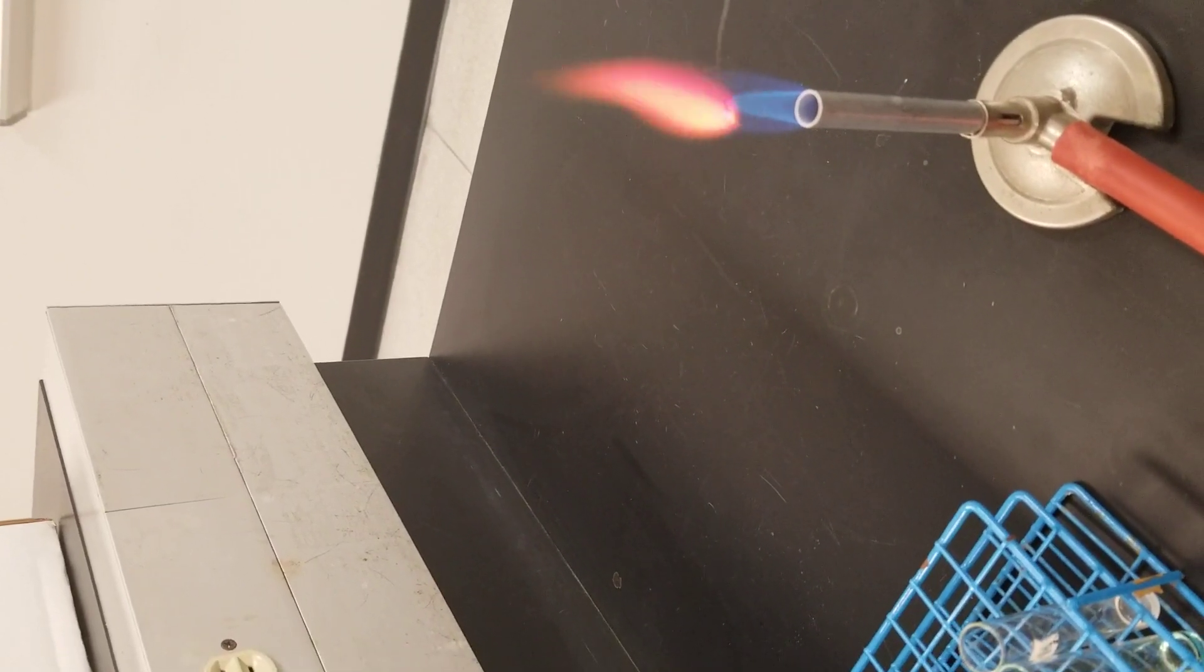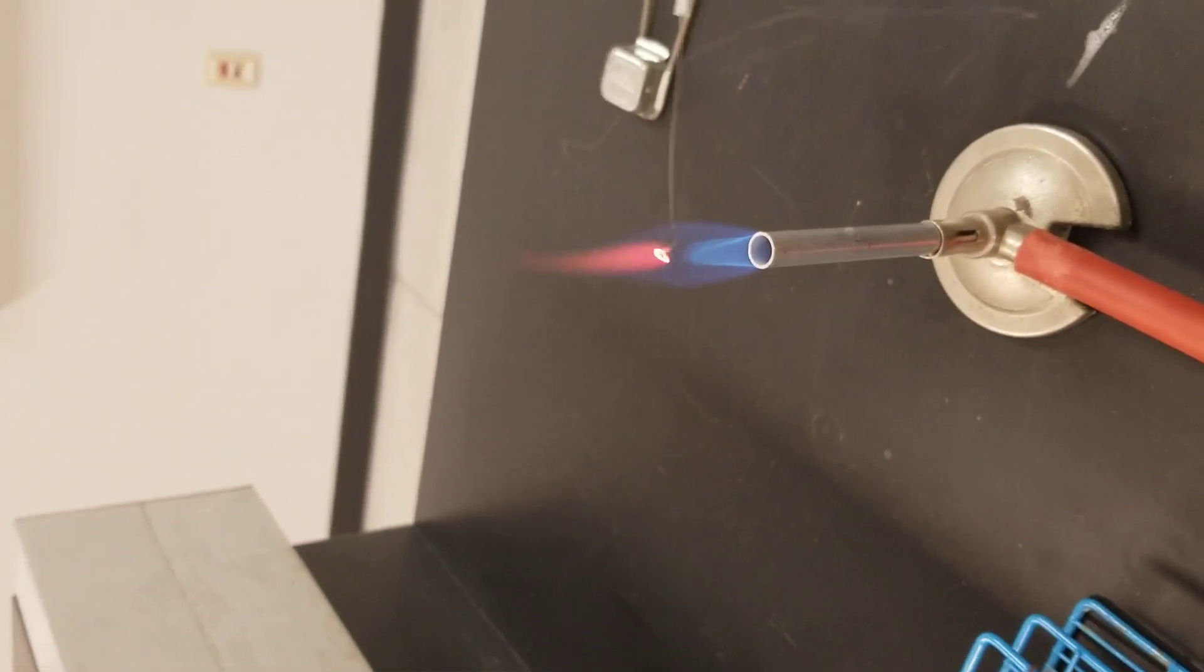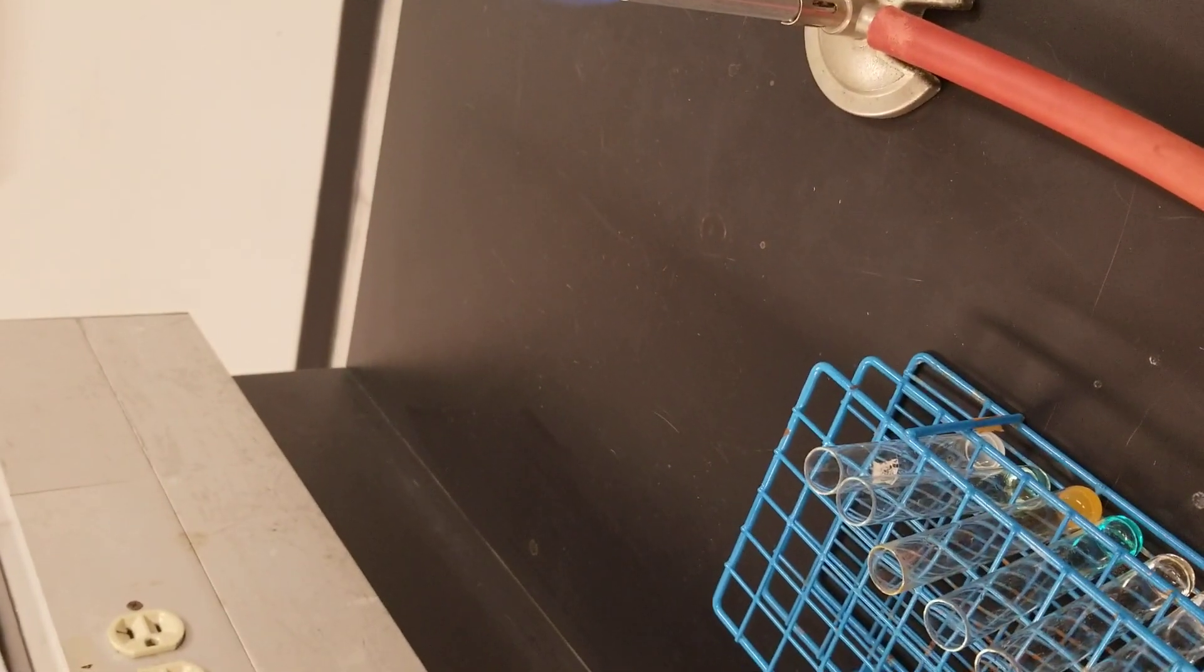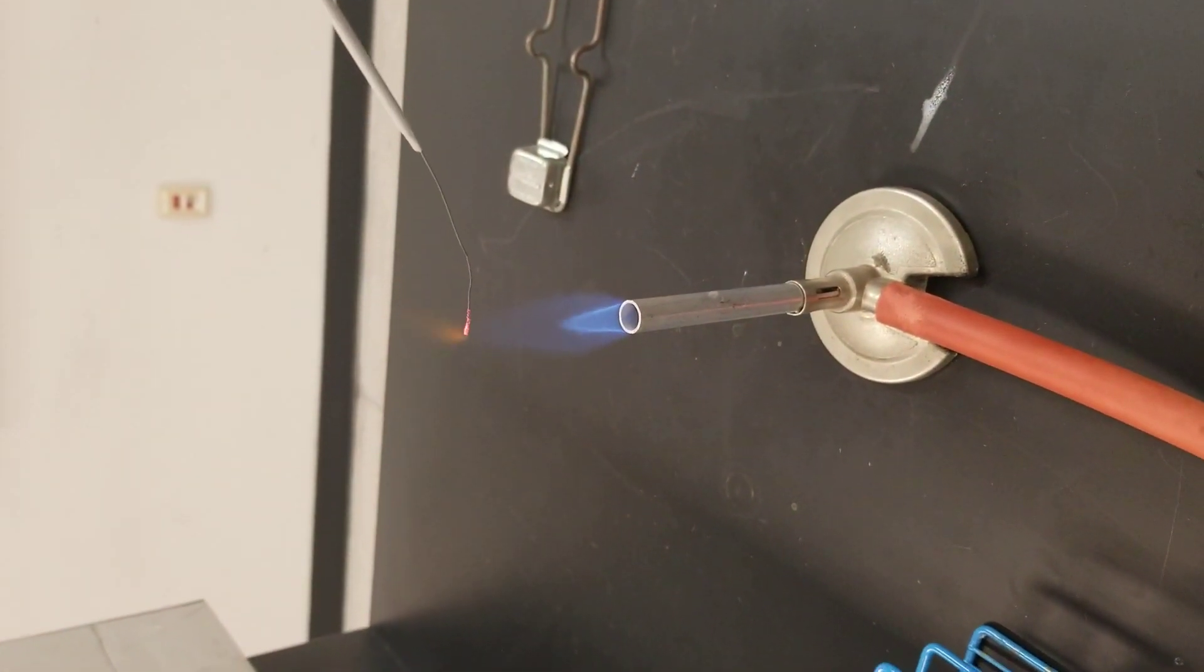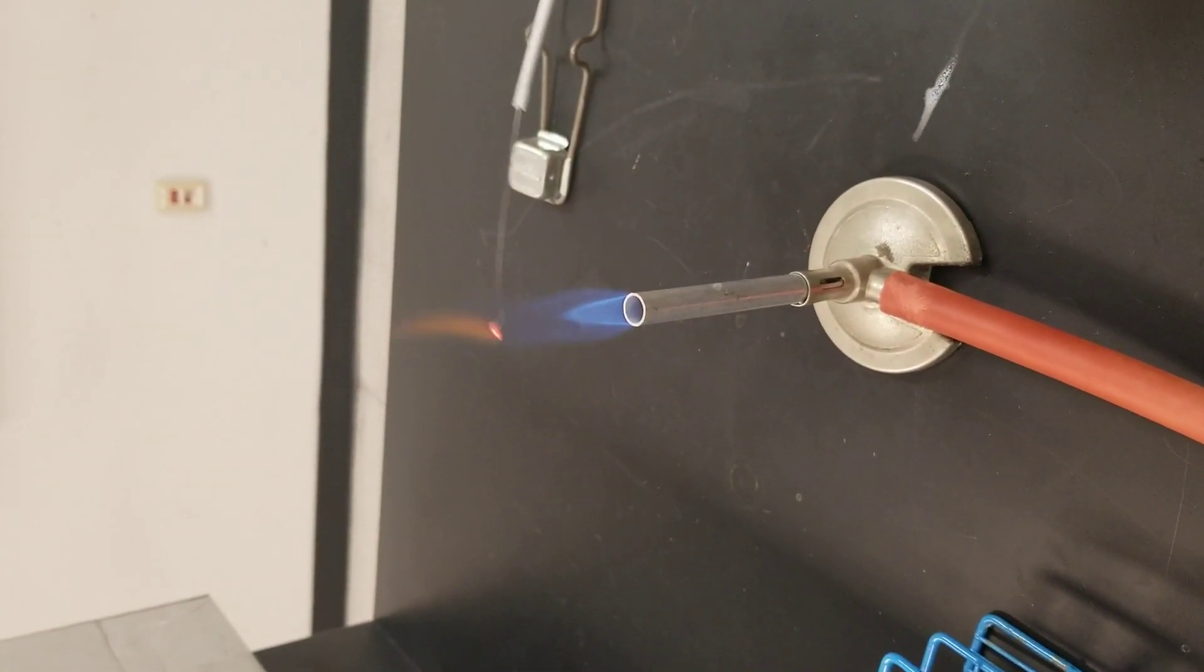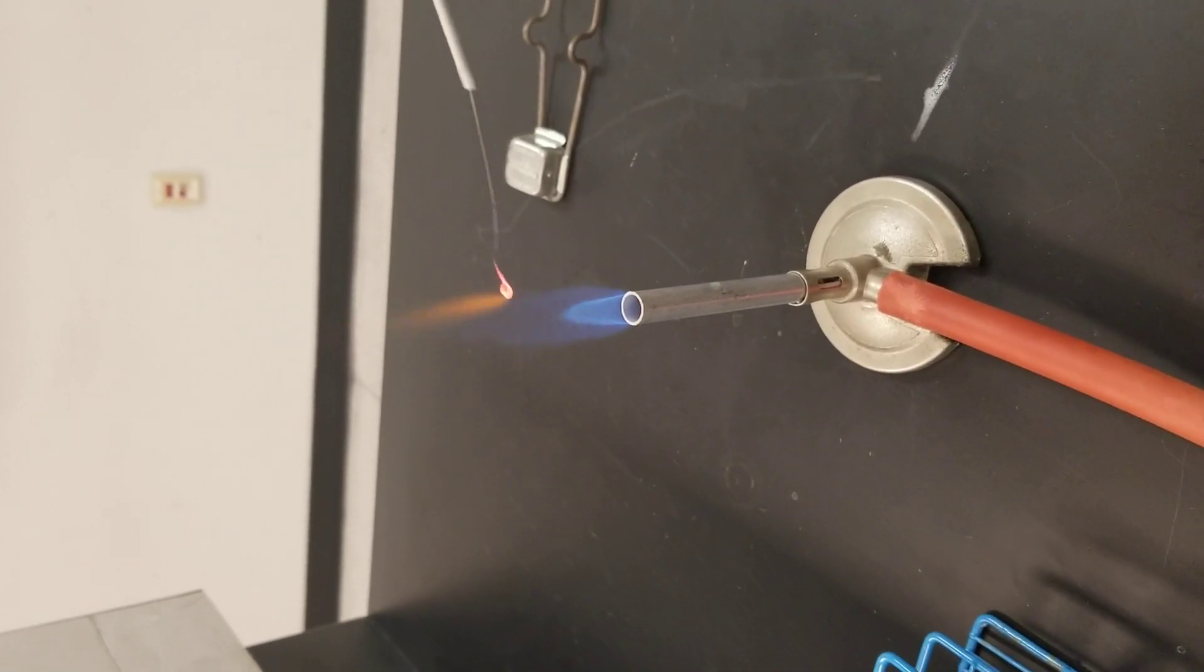Right now it looks like this is not clean. That's why I have to dip it into the nitric acid solution. This one is the nitric acid. Now the flame test wire is clean.